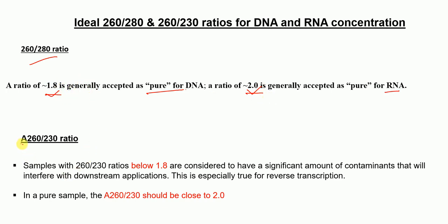When talking about the 260/230 ratio, samples with 260/230 ratios below 1.8 are considered to have significant amounts of contaminants that will interfere with downstream applications. In a pure sample, the 260/230 ratio should be close to 2 — ideally between 1.8 and 2.